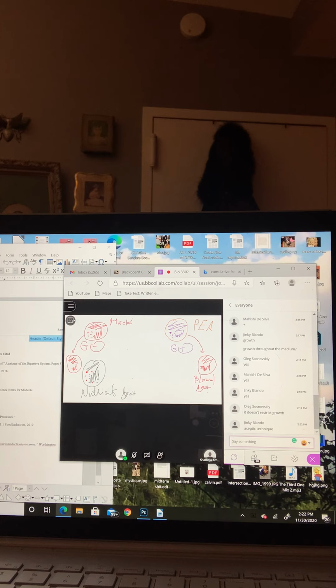Sometimes in our lab, after incubation, some people cannot get anything on the plate, so there is something wrong. That's why you have to use good aseptic technique from the beginning.